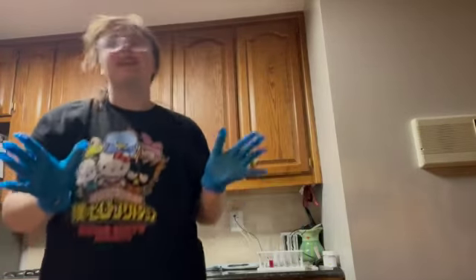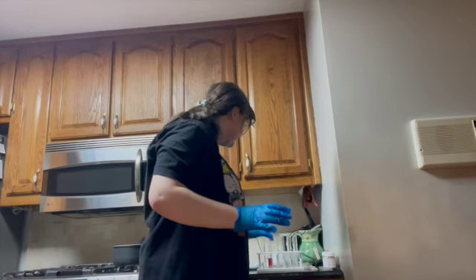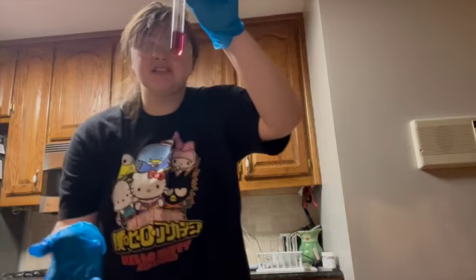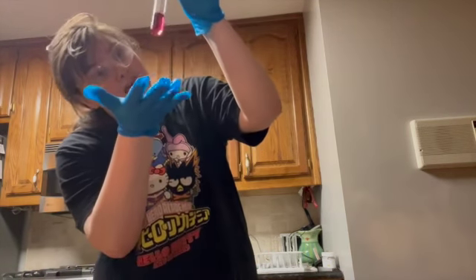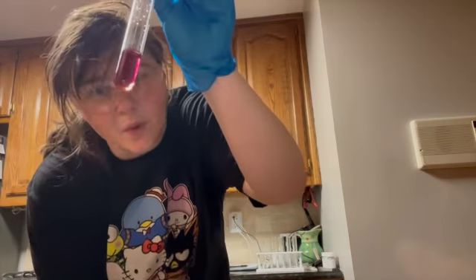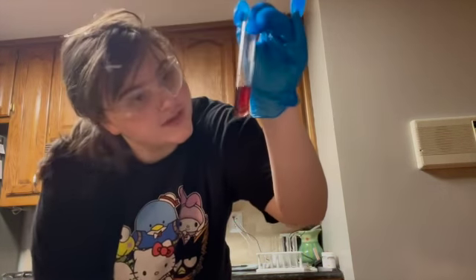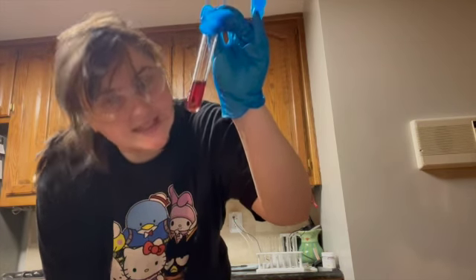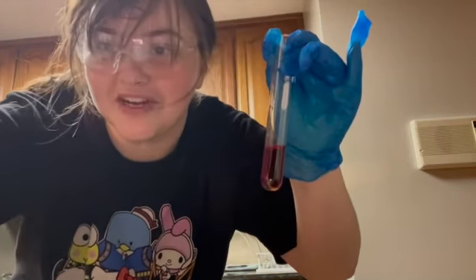So we're at 11 minutes and 30 seconds, and this is slowly starting to change. It was this really dark red, but now towards the bottom, there's even a hint of orange showing up. I don't know if it can show on camera, but it's changed a lot in a matter of 2 minutes.